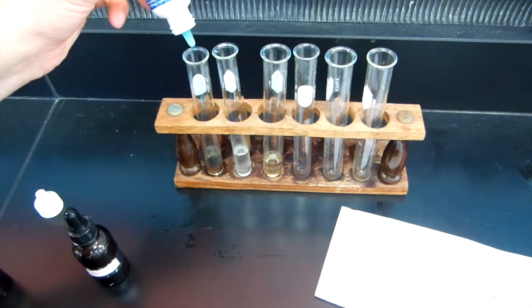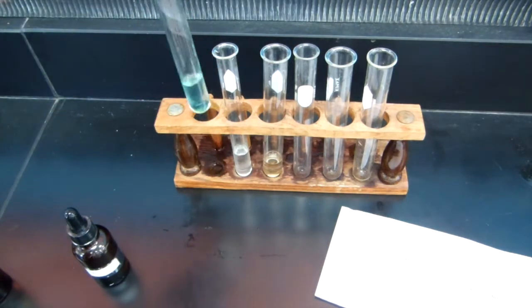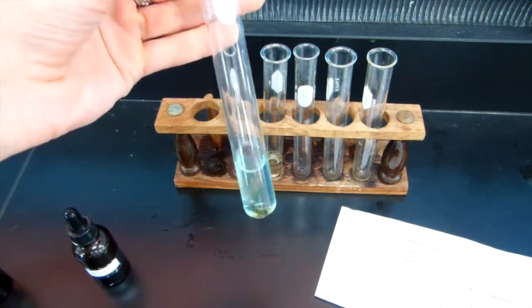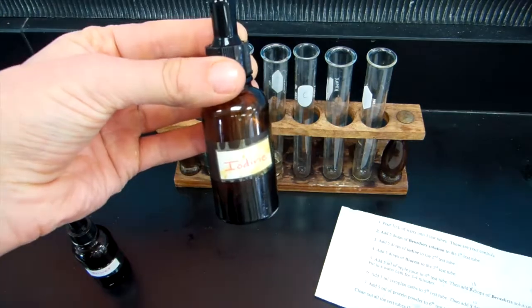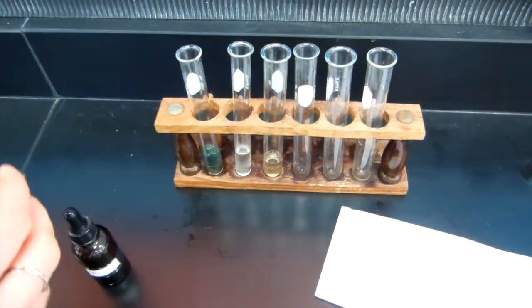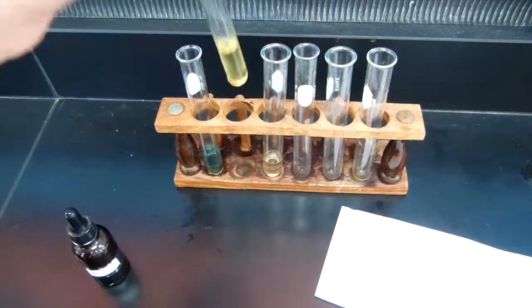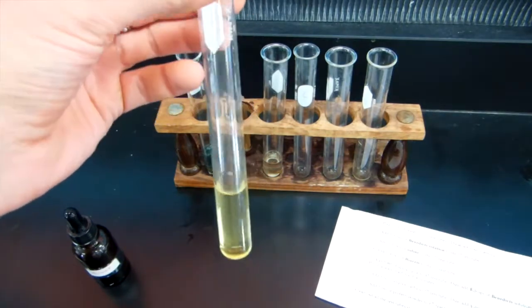So 1, 2, 3, 4, 5, 6, 7, 8, 9, 10. Just kind of mixing that around. In the second, so you go ahead, record the color of that. That's the control. Iodine is going to be in the second tube, and we'll do 10 drops of that as well. Mixing that up. What color is that? Go ahead and write it down.